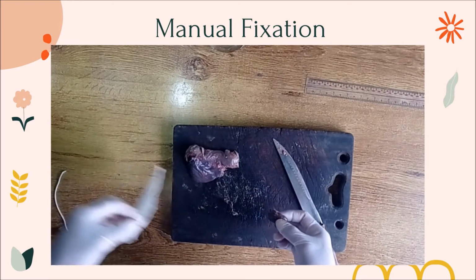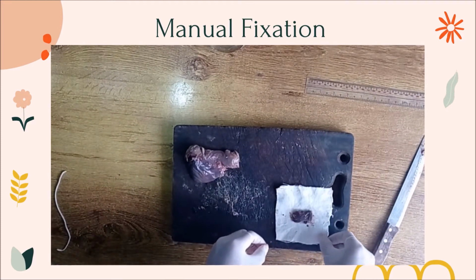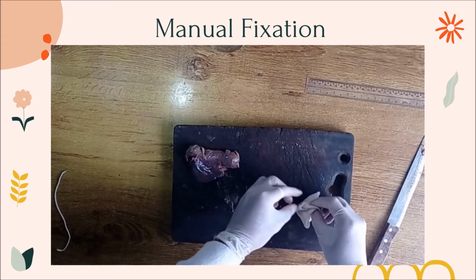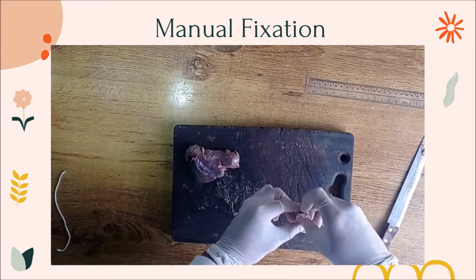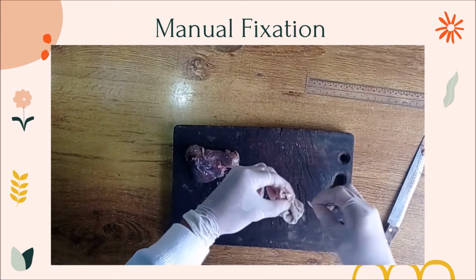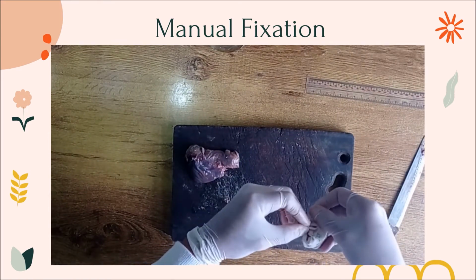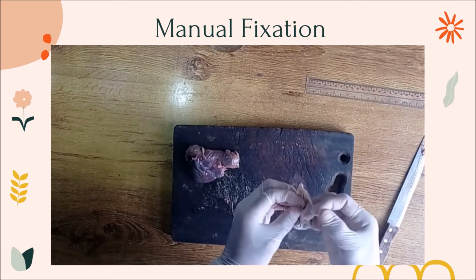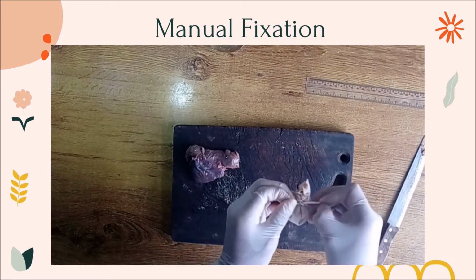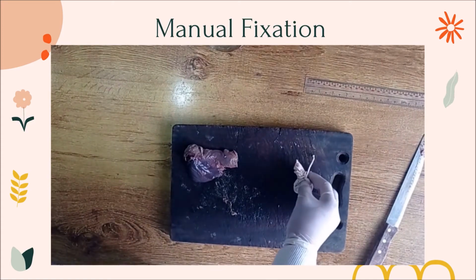So in this demonstration, we will only have the gauze pad. So what we will do is wrap the tissue sample with this gauze pad. And next, we will tie it with a knot. So after this step, let's not forget to label the specimen.